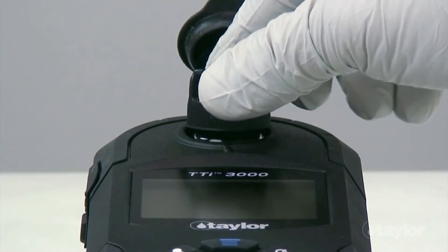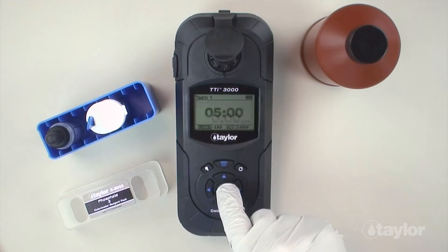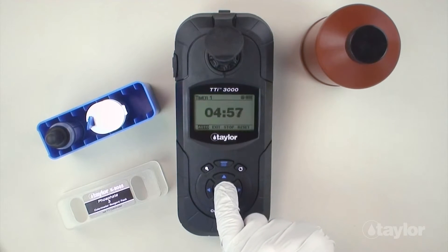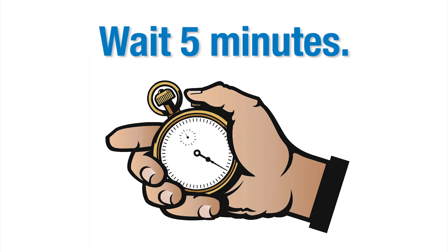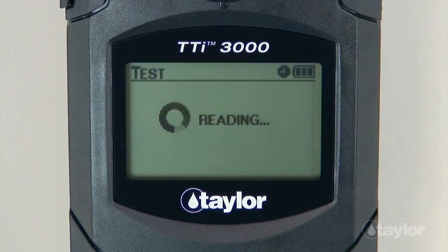Insert the sample cell into the sample cell compartment. Select timer using the scroll arrows, then press Enter. Select Start, and then press Enter. A 5-minute countdown will begin. Immediately select Auto, and then press Enter. When the timer beeps, the instrument will read the sample, and the result will be displayed.